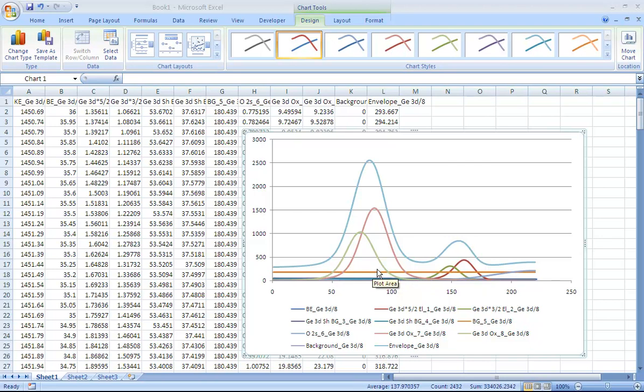However, you don't have to do this in Excel. There is a way of exporting the data from CASXPS that will include the curves forming the photo emission peaks and the background.